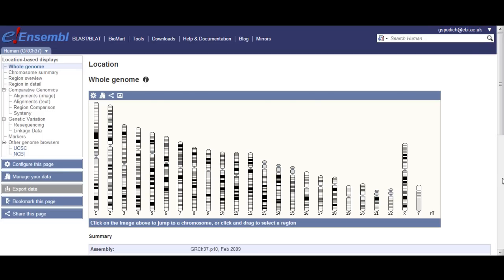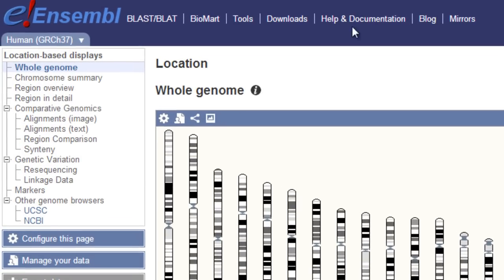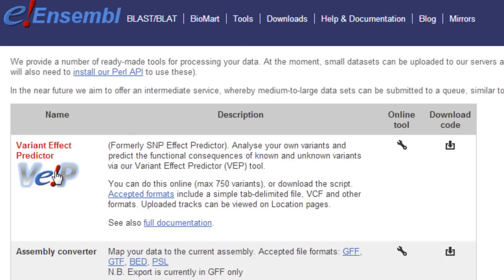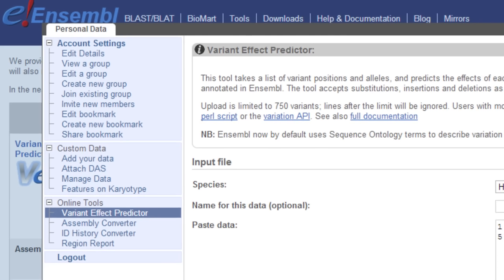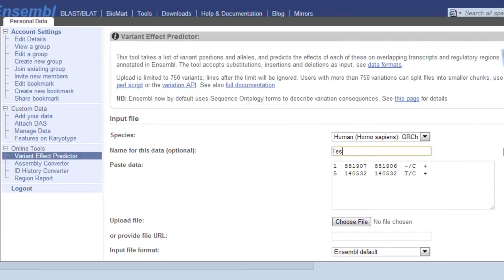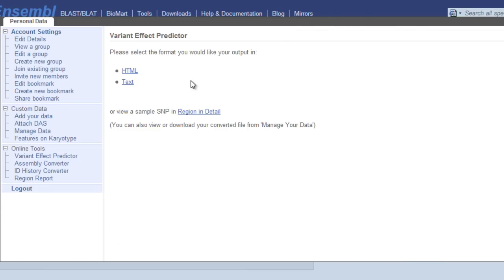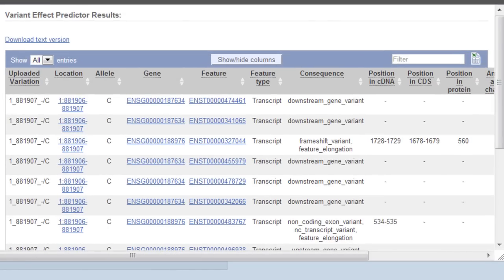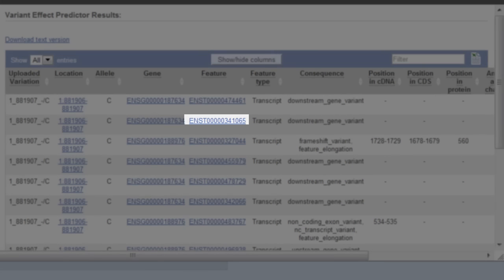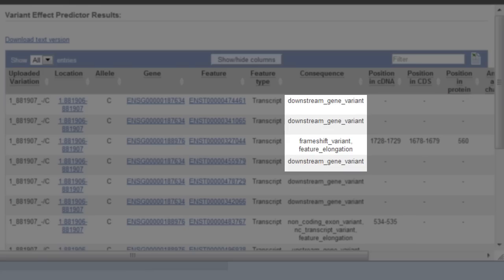Finally, what if you have a list of alleles and genomic positions? You can use our most popular tool called the VEP — Variant Effect Predictor — to load them in and determine the effect on genes and transcripts. Go to the Tools menu and click on VEP. In the example here, we see one insertion and one SNP, or single nucleotide polymorphism. Let's name this, then click Next, then HTML. Here are the results: we see any genes and transcripts in the region of these variants, and also exactly where those variants fall — either downstream or within the coding sequence, for example.